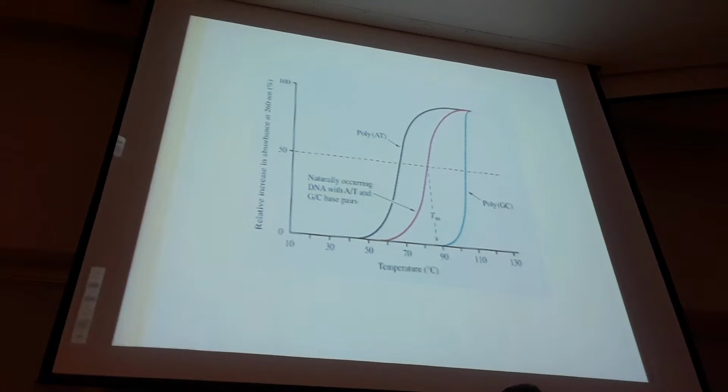And then you play around with temperatures of your samples, okay, and utilize an increase in temperature to actually separate the double-stranded molecule to make your gene and one strand accessible for DNA polymerase, okay, and then you lower the temperature to a certain point where your primers, your synthetic oligonucleotides can actually hybridize with these flanking regions, and then you allow polymerase actually to synthesize your gene of interest in between.